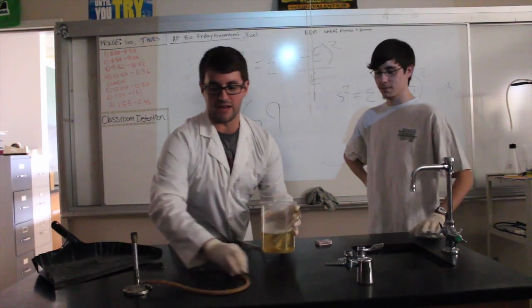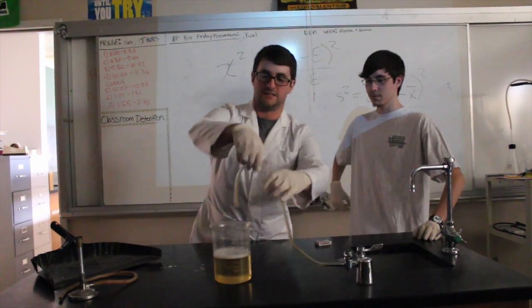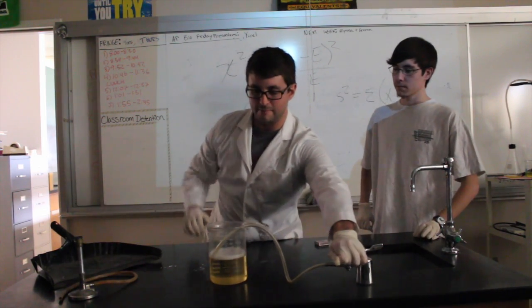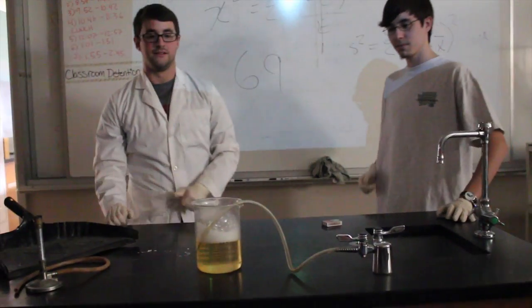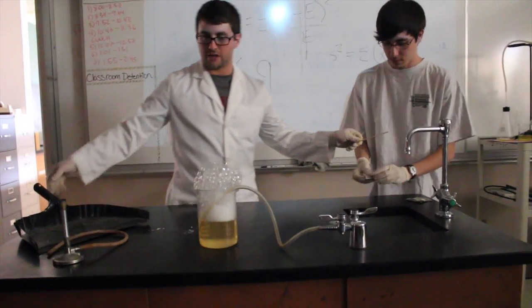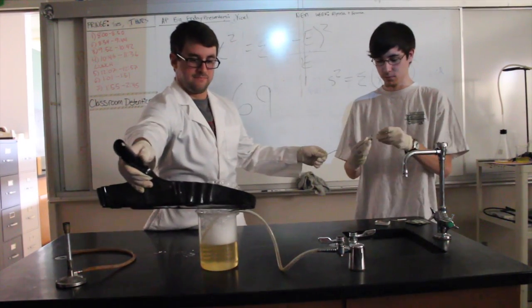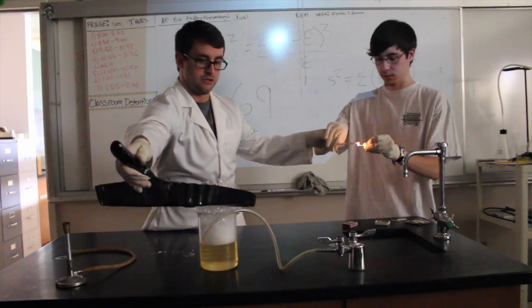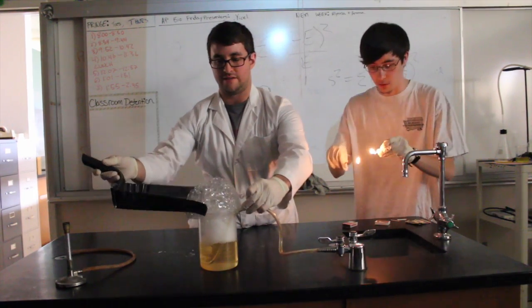We're playing with fire again. Oh, this is the bubbles. Let's just put that in here. See if we can create any bubbles. Hopefully I added enough soap. And Ben, I want you to go ahead, light a match on this wooden splint so you're not going to burn yourself. Alrighty. Take the wooden splint. Oh, good lord, I opened it too far. Here. Take that then. I want you to hold that. Hurry. Come on, light. We want to use a lot of bubbles, don't we? There we go.